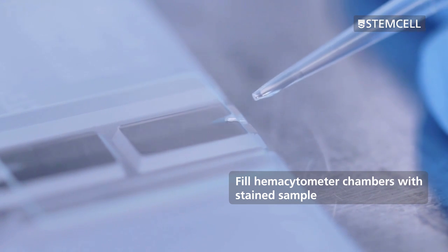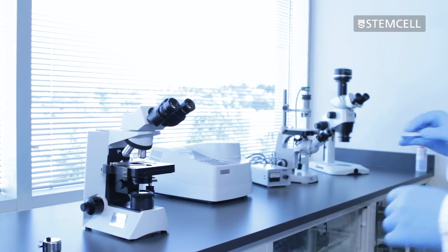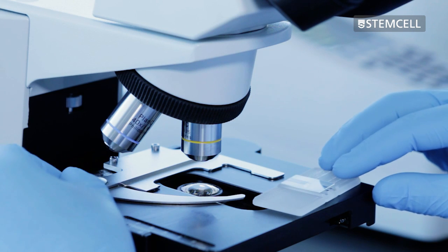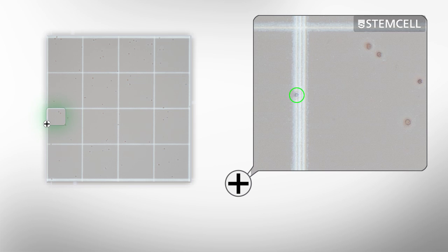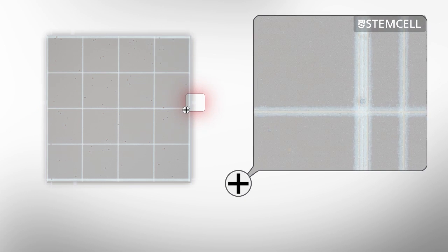Do not under or overfill the chambers. If bubbles appear in the chamber after filling, start again with a clean and dry coverslip and hemocytometer. You are now ready to count your cells using a binocular microscope adjusted to 10 times power. Count the stained nuclei in each of the four quadrants of the hemocytometer, including those that lie on the bottom and left-hand perimeters and excluding those that lie on the top and right-hand perimeters.